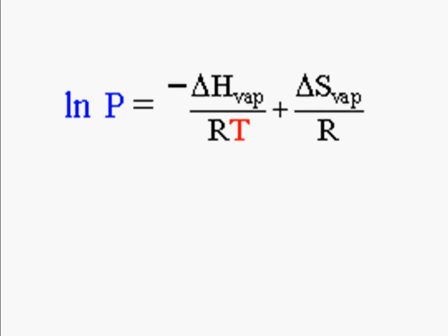In this screencast, my goal is to help you understand how the experiment is actually going to be done for the enthalpy of vaporization and entropy of vaporization experiment. Here's our equation of the day, and as you've already read about, the vapor pressure of water is related to the temperature of water by this equation.